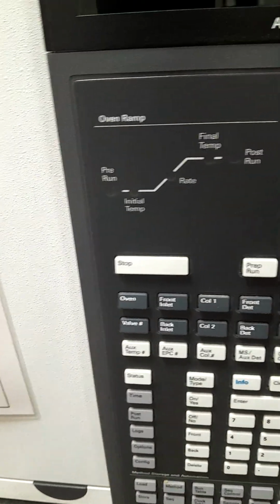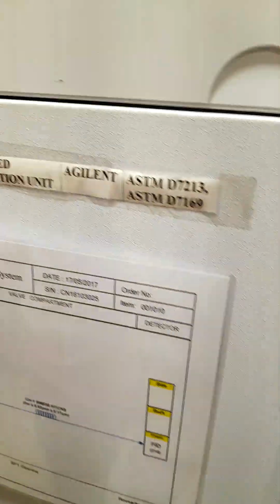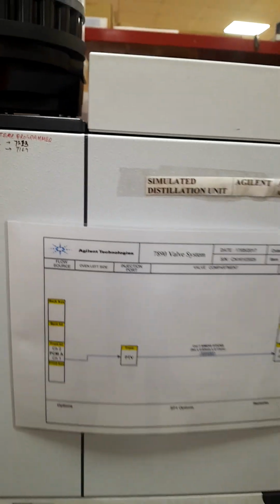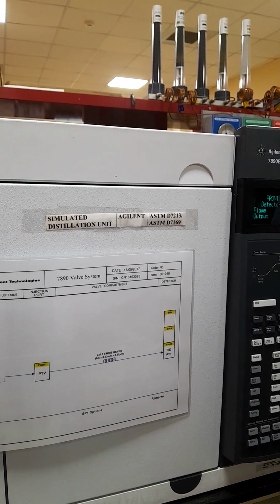Although we have the compressor setup also, that air is used for another application, where we use only oxygen parameters, such as surface oxidation, and there we can use compressed air. So this is all about this GC and the parameters shown here.